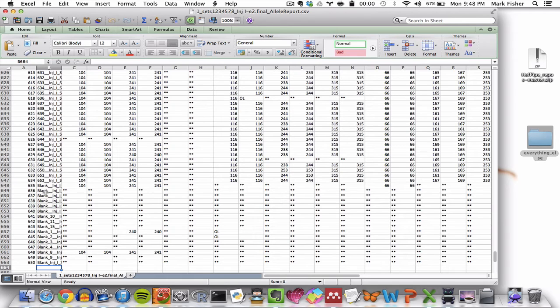non-digit character. So this means that while the sample numbers must be consistent across allele reports, so 642 can't be called some other number in an allele report, the other information is allowed to be different. Right, so this sample could be 642 and then some other completely different character string in a different file, as long as it started with 642 and that was the last digit.